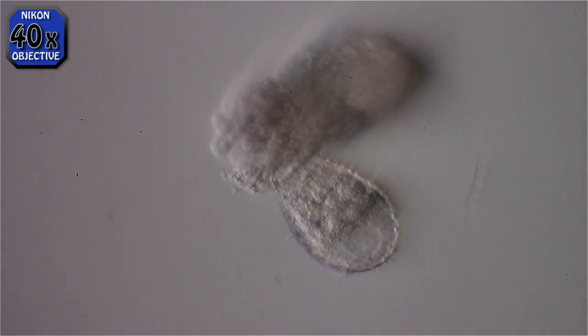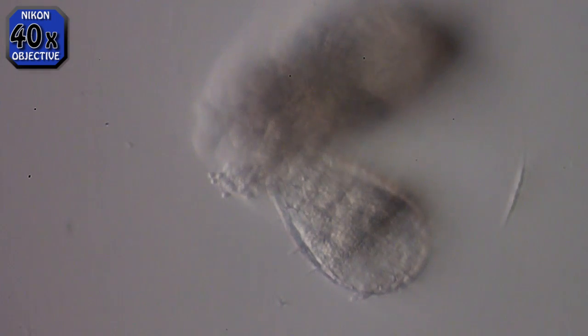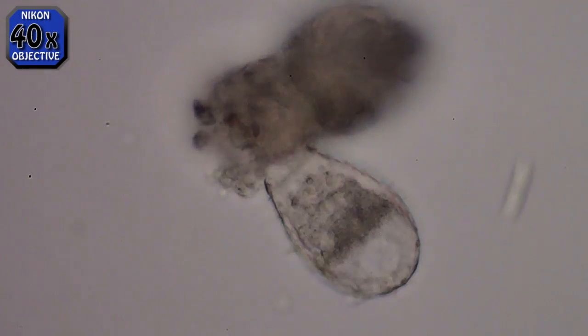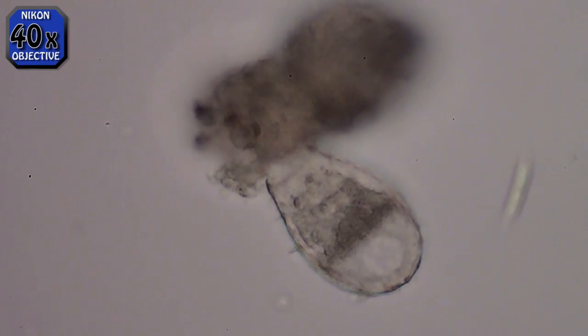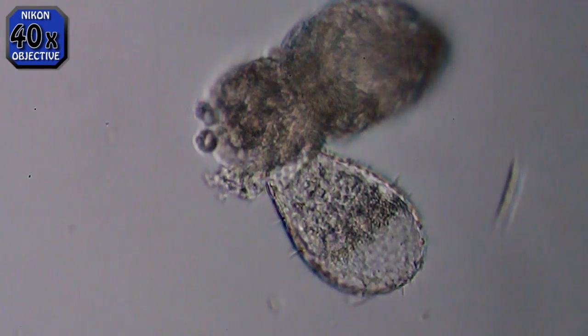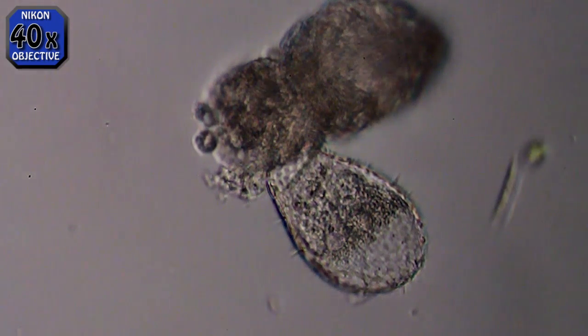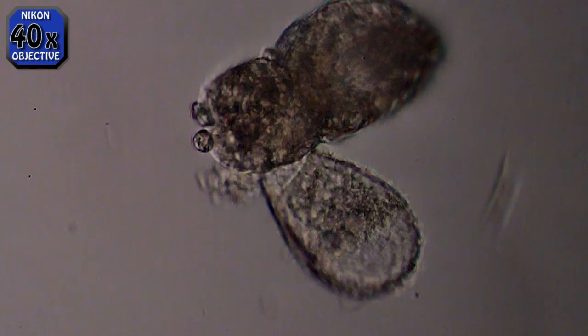Now I've switched to bright field position on a Nikon Fluophot phase contrast condenser and slightly offset the wheel so it gives a little bit of oblique, kind of a 3D type of effect. You can kind of see the saw teeth there at the narrow end of him. I still can't figure out what he might be eating on.